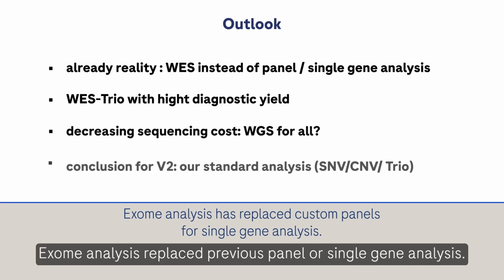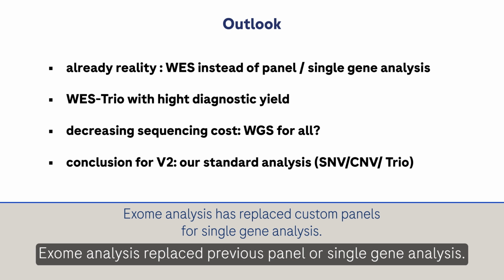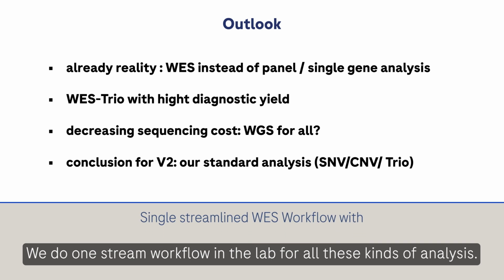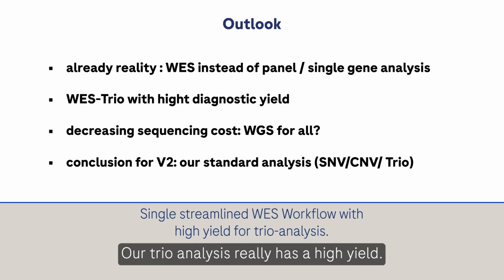Exome analysis replaced previous panel or single gene analysis. We do one streamlined workflow in the lab for all these kinds of analysis. Our trio analysis really has a high yield.